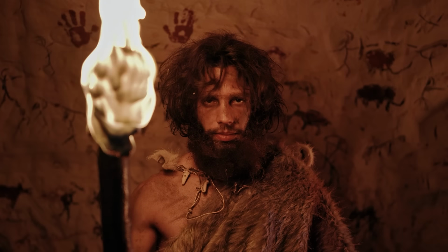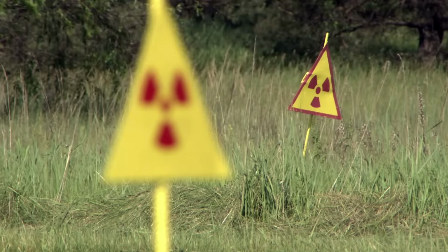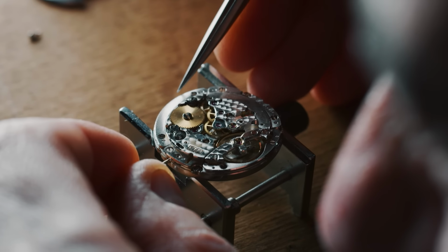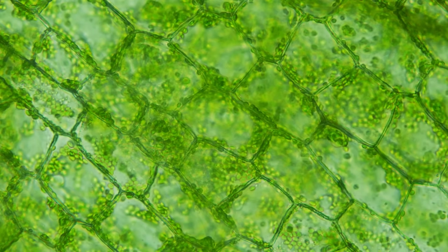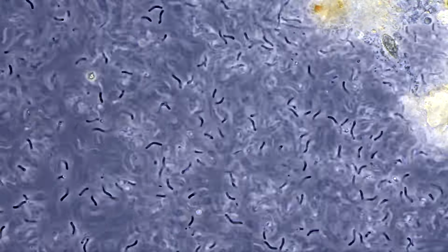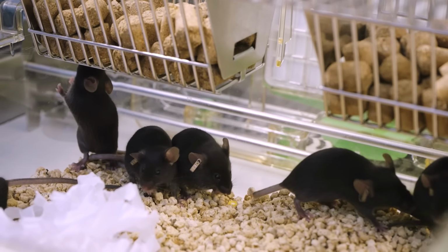But thankfully, we're not Neolithic humans anymore, and now we can just go in and directly change and add or remove whatever gene needs tweaking. So let's move on from random to precision, and learn how we can just print and insert DNA however we want. Now, the first thing you need to do before you start printing is pick the organism you want to work with. There are many to choose from, and scientists have also isolated examples from almost every area of nature and chosen examples to work with that have become so-called lab strains.